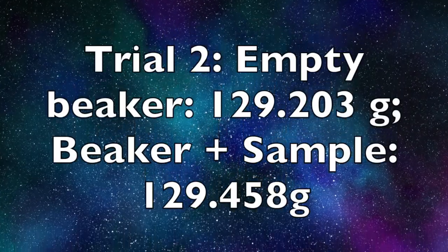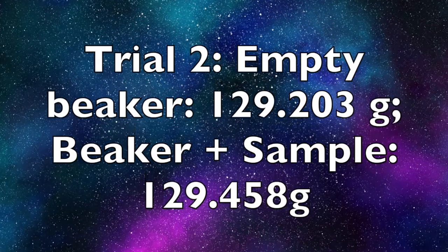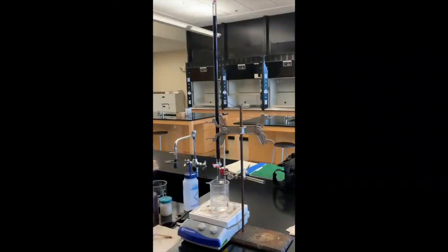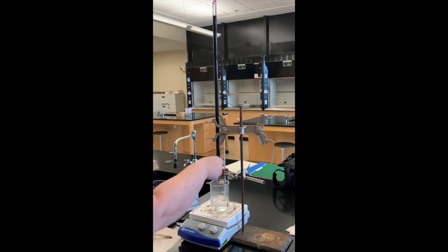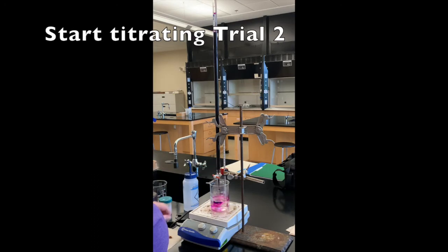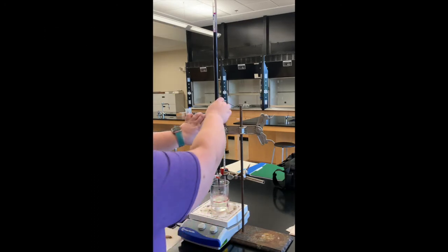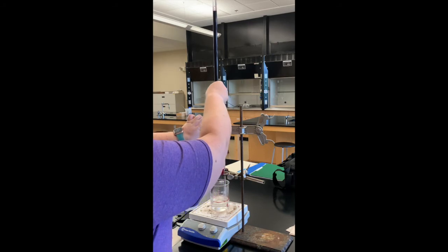We're ready for trial two of Part C. The initial volume in our burette now is 0.9 milliliters. We're still looking for that pink color change. I'm going to adjust the temperature a little bit so it doesn't get too hot. I think before I do this titration I'm going to change out the stir bar.